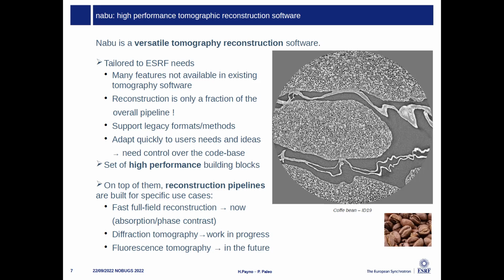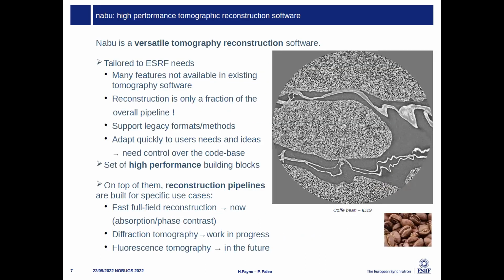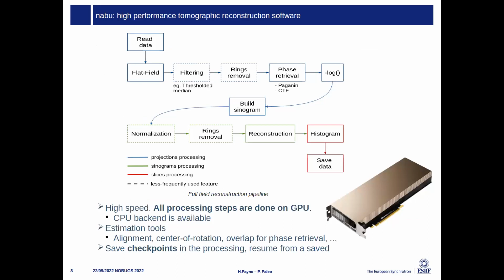One which is ongoing, which Pierre is working on, is diffraction tomography. I think it's almost done, implementing some feedback from the users. And then what's next, I would say, is the fluorescence tomography. So maybe next year, we'll see, but that's one of the next items to take up.